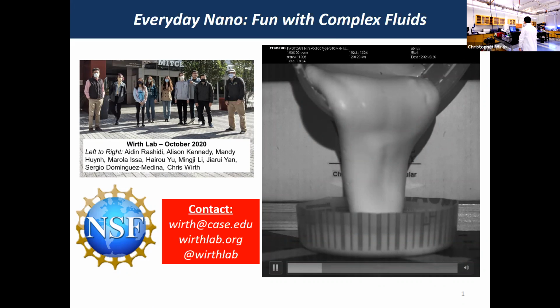So I guess the first thing I want to do is just give you a tour of my lab. So I'll try to do this in an efficient manner. So this is the laboratory. It essentially consists of one large room. That large room has a couple bays where we have experimental setups. And then there's a little bit of an office area here. Most of my students actually have offices in another room, but this is just an area where they can set up and work.